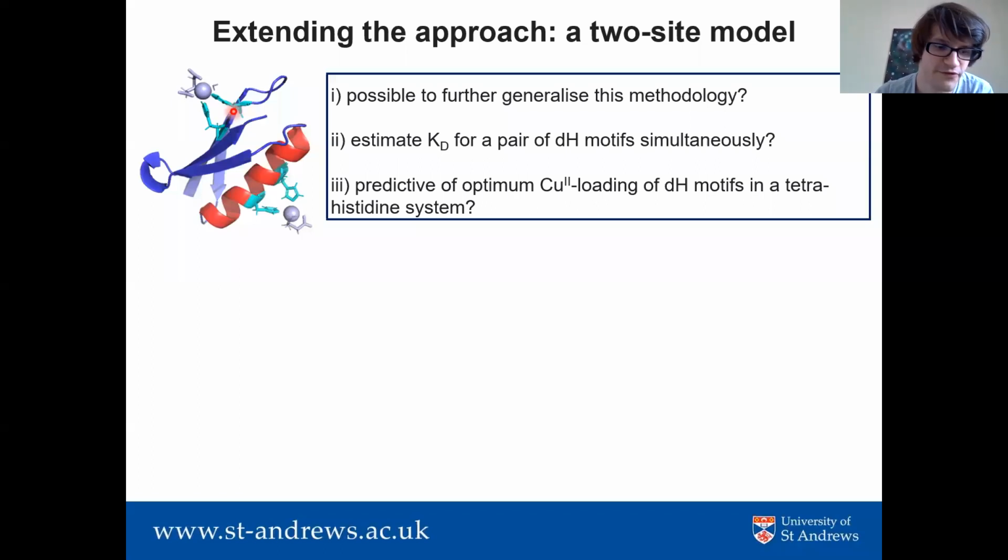If you have very high binding affinity, this is a reasonably trivial problem. But under conditions of lower binding affinity, that is, if your labeling is non-quantitative, you'll need an excess of your copper chelate in order to saturate the site. But as I mentioned already, you don't want to add a vast excess. And so it's about finding the right balance.